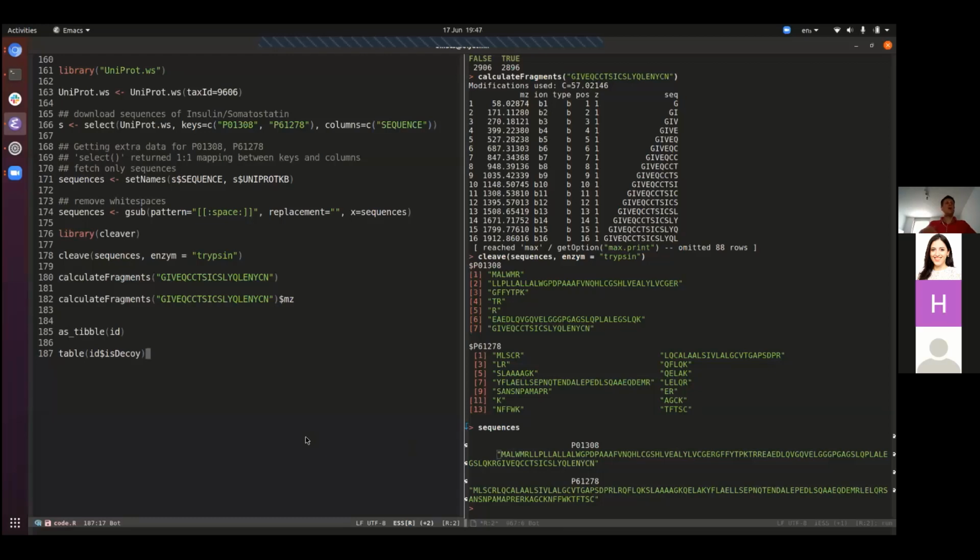And now we have two distributions of scores. One distribution from the real proteins or real peptides, and one distribution of scores that we know are not correct. That's a null distribution of scores. It's a distribution of scores against peptides that are not human, but they are very much like human peptides.